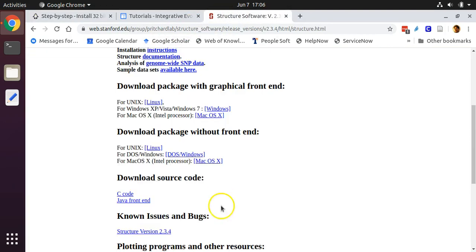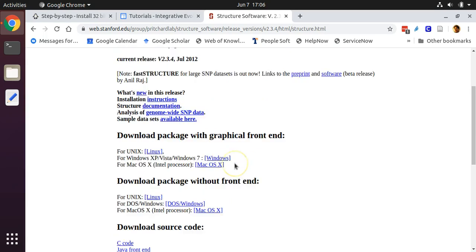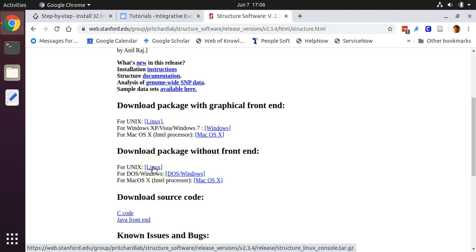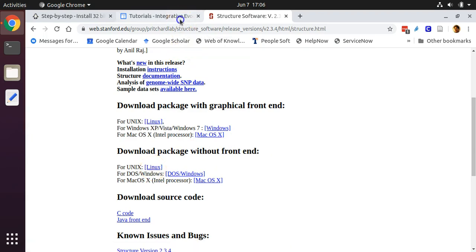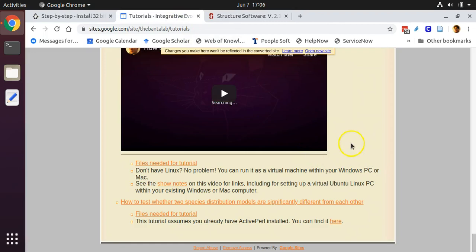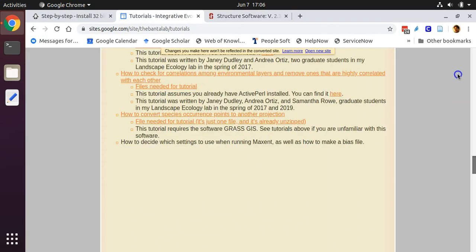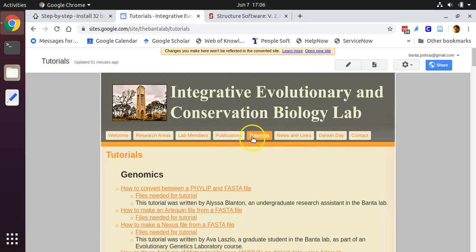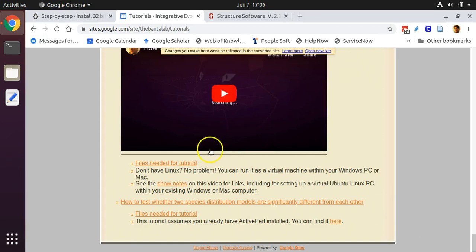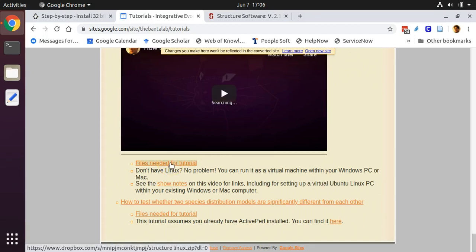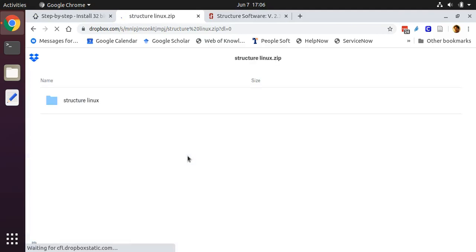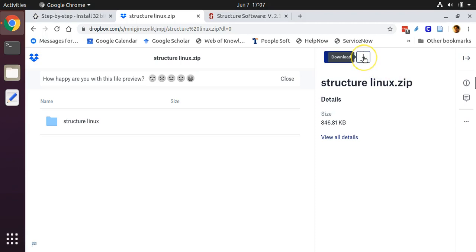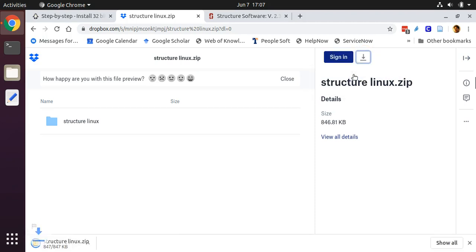You can download the command line version from the STRUCTURE website and click on download package without front end for Linux. Or what I recommend is to download it from my website, joshbanta.com. From there, click on tutorials and scroll to the bottom for the data accompanying this tutorial. The reason I suggest downloading from my website is that I have included some extra files so that I can demo for you how to use STRUCTURE once you have it installed. Click on the download button and select direct download.